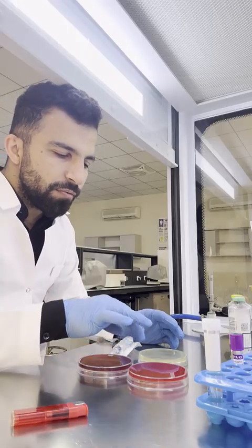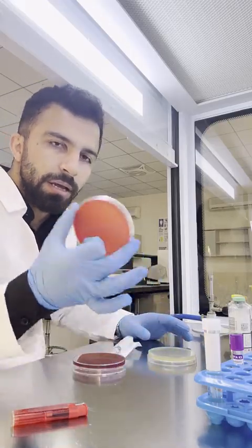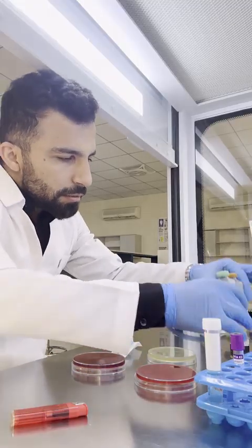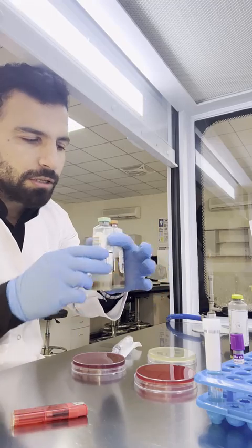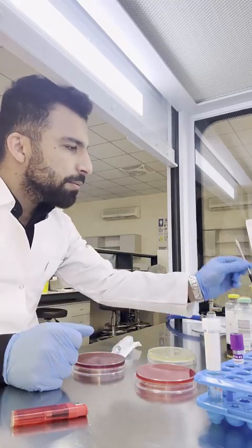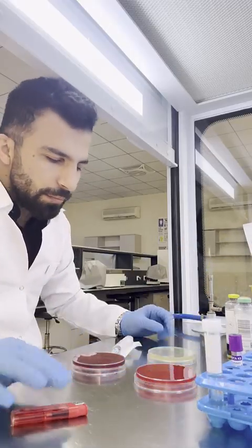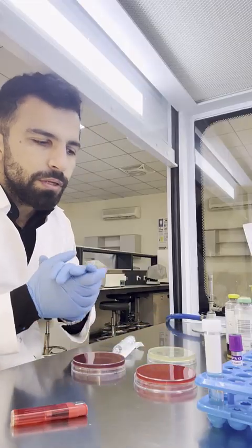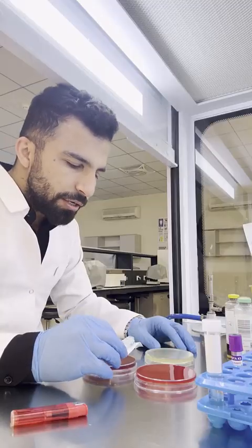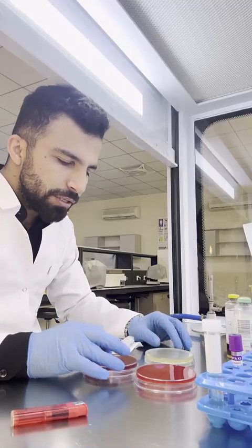We have three types of agar here: nutrient agar, MacConkey agar, and blood agar. And for all the requirements, we have the blood bottles culture, Bunsen burner, the inoculating loop, and a urine sample. Everything is ready to do the procedure. Before we get to the culturing of bacteria, we are going to introduce these culture media.